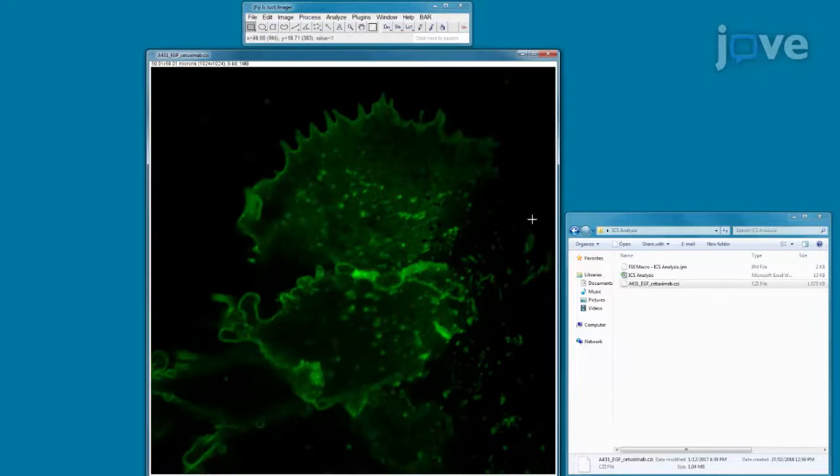Additionally, capture a flat surface on the apical or basal surface, as well as a cell-free region for later sample normalization.